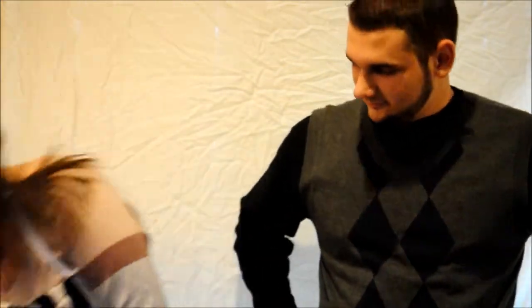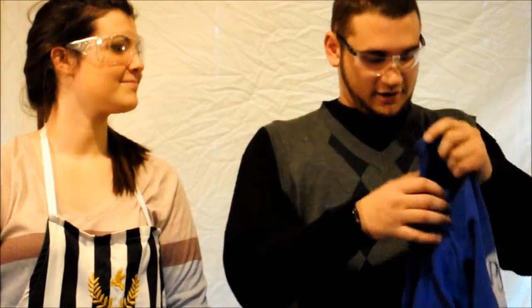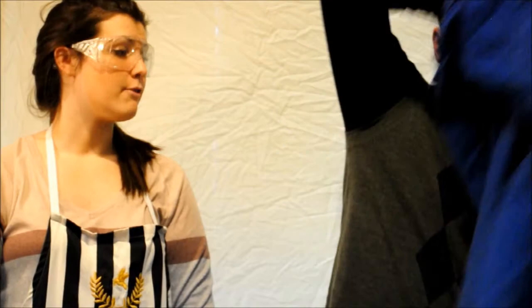But if we are handling dangerous chemicals or glassware, it's important that you always wear goggles and a lab coat. Thanks. Put that on, Dexter. These are especially important if we're handling fire too, because if a fire was to burn you, it's better to burn through the lab coat than to burn on your own skin. Wow, Dexter, you really look like you're ready to start an experiment. I am. And one more thing.